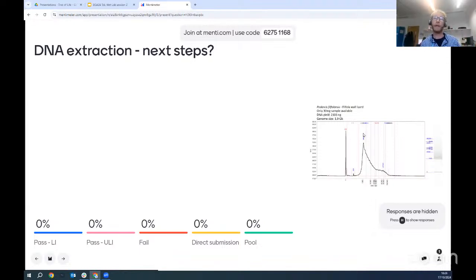When we do DNA extractions, we ideally put in 25 milligrams of material for metazoa extractions. However, we also need material to do Hi-C sequencing as well as RNA extractions. So we have to partition this sample into 3 bits to try and get data from all 3 sequencing platforms. So this is a slightly trickier one, I think.